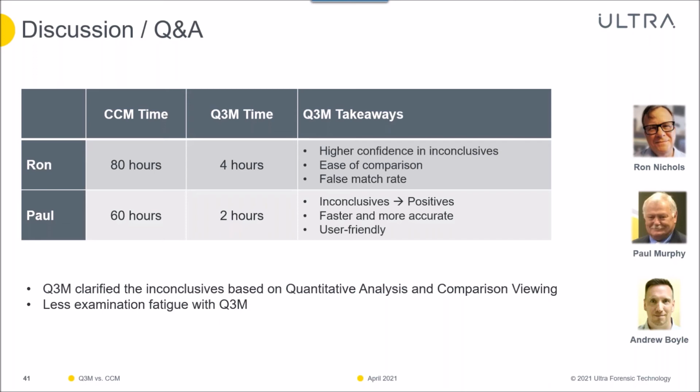Okay. And also the quantitative analysis, the court has been asking for this for a long time, and I think with the quantitative analysis that we have in the quantum 3D microscope, together with a comparison viewer, that's just going to be another tool for the firearms examiner.